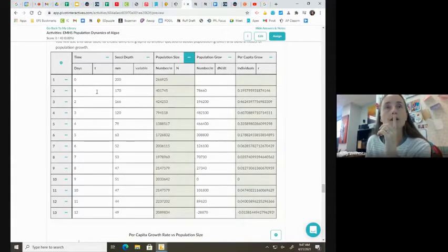And so then you're trying to figure out how much it grew. This is where I'm like, this is not 78,000. I don't know what they're doing here. So in the end I ended up ignoring their data and their calculations and doing my own. If I had 266,925 algae and now I have 401,000, what was the growth there? And I put that number there. And I did the whole entire column.